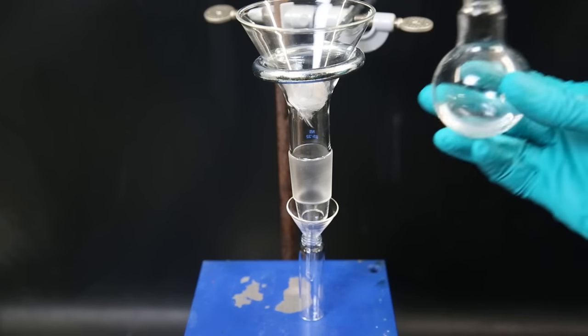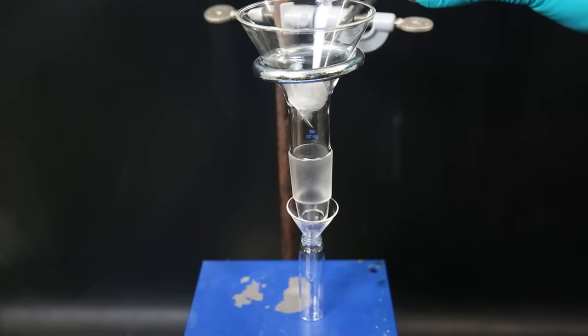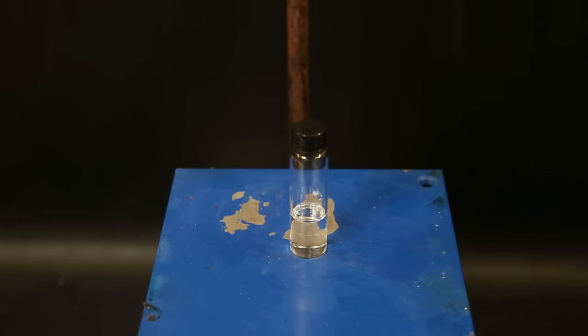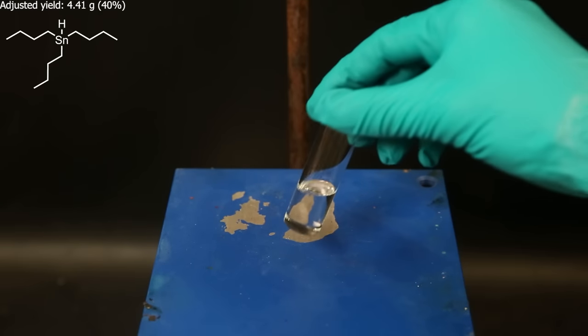So to get it out, I set up a funnel with a small bit of chemically resistant glass wool and filter it all through directly into a vial. When all of it has been filtered, I am left with a clear liquid. The final yield turned out to be 40%.